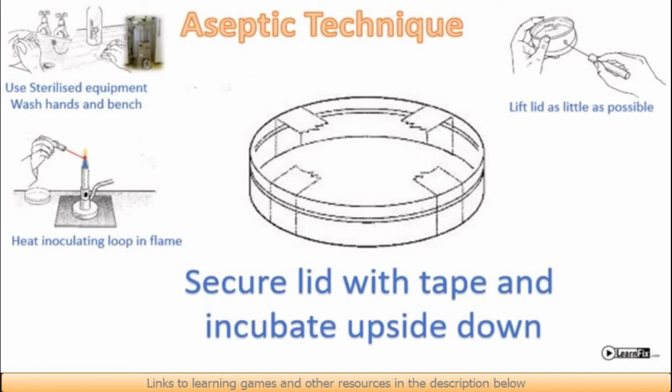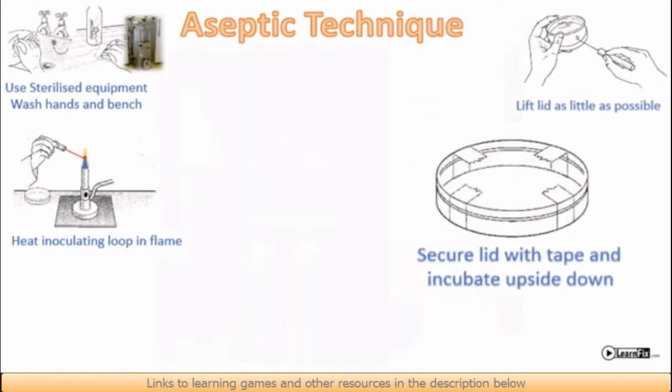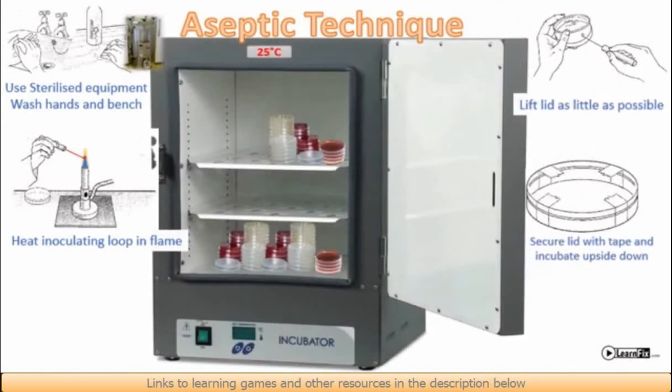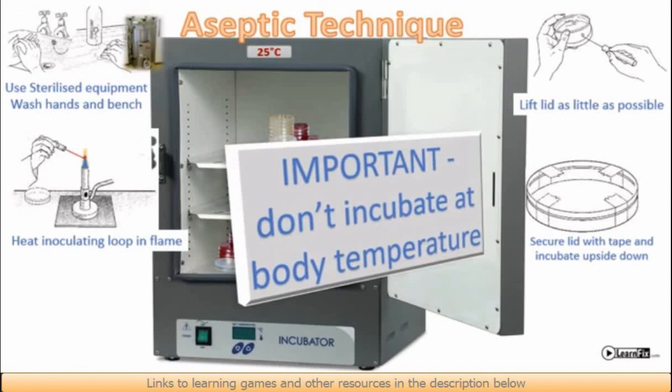A warm environment allows bacteria to grow quickly. But if it's too warm we risk growing dangerous bacteria. To avoid this problem school laboratories don't incubate above 25 degrees centigrade which is well below human body temperature. Industrial laboratories in hospitals for example may use higher temperatures to grow bacteria quicker. But they will have far stricter hygiene precautions to prevent bacteria spreading by accident.